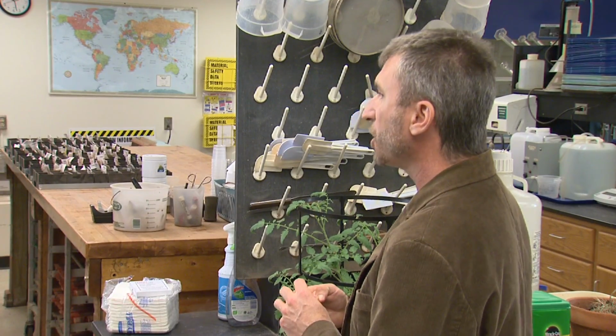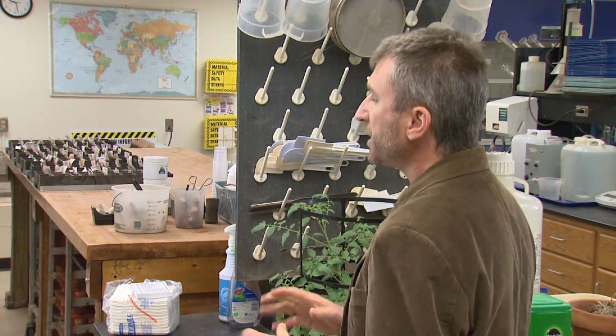To show you how this is done, I'm going to take you on a tour of the soil test laboratory here in the plant science department at Oklahoma State University. And on this tour, you're going to see why you learned a number of things in high school, like electromagnetic radiation and the structure of an atom, because those scientific concepts are necessary for determining the amount of nutrients in a soil.